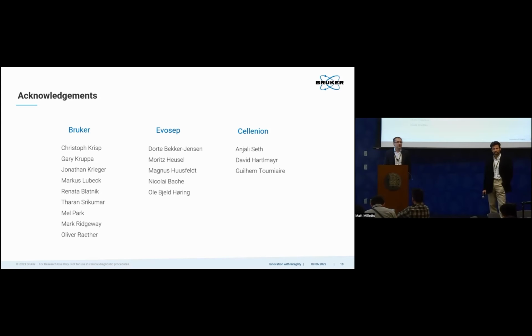Yeah, great question. So to answer your first question about use of the ions, I didn't really talk about this too much, but the fact that we are trapping ions and then moving them across and releasing them group by group, where in parallel we're accumulating another packet of ions, means our duty cycle and our use of the ions is really, really high. We're ramping down the field and releasing them, not one by one, but group by group.